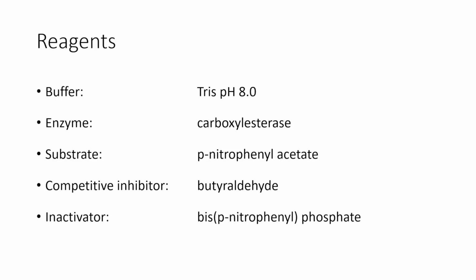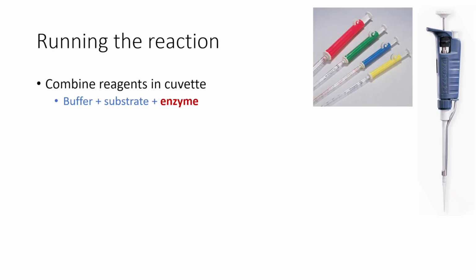I just want to note that we'll have a number of different solutions that contain various concentrations of some of these. There might also be solutions that have different combinations of some of these different reagents within them. So please be careful to read all of the labels very carefully and make sure that what you're intending to add for each reaction that you're monitoring is what you are actually adding, especially because some of these components have very similar names to each other. So I encourage you to be very cautious and careful as you prepare all the different samples that you're going to analyze in this experiment.